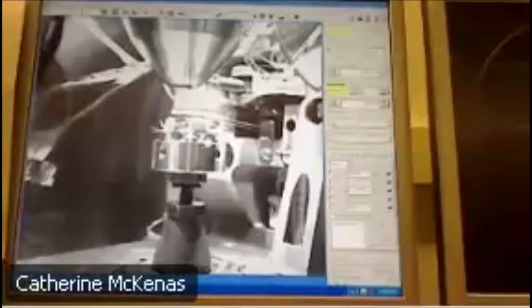And the real benefit of using microscopes is being able to see really, really small things. With our eye, we can see each other, we can see our hands, we can see our fingers, we can even see our hair. But our hair, that's about our limit. The width of a human hair is 100 microns. A light microscope can see that, and it can see a red blood cell, which is about 10 microns, and it can even see bacteria, but it reaches its limit there at bacteria. An electron microscope, though, can see things like viruses all the way down to an atom.